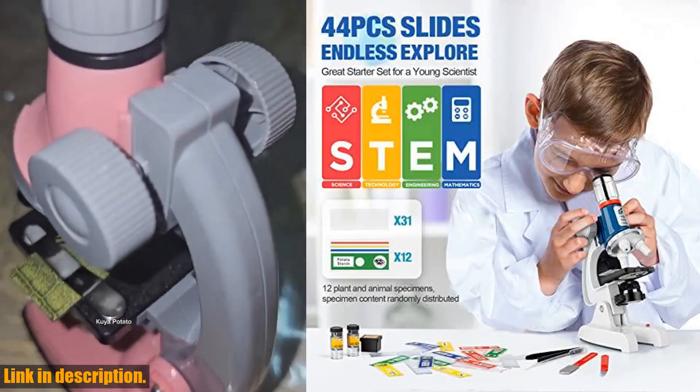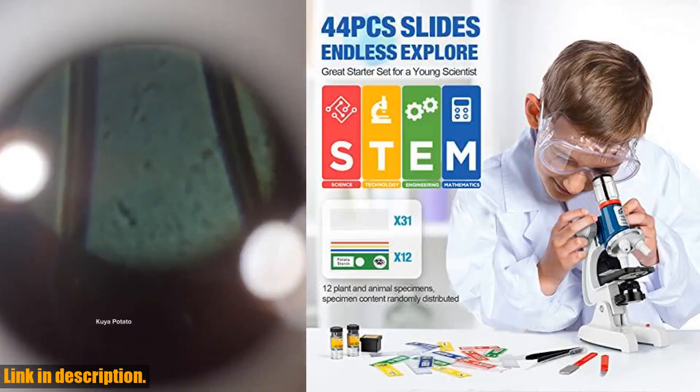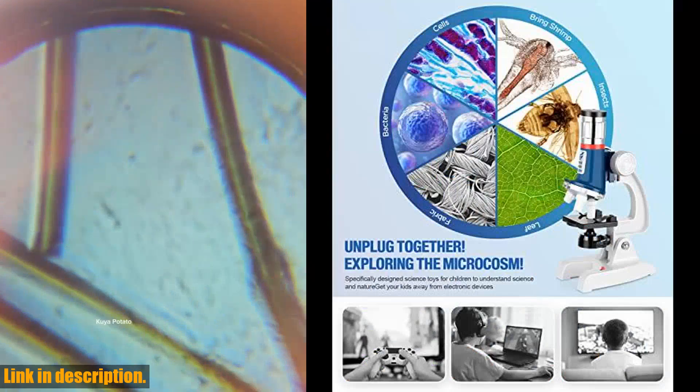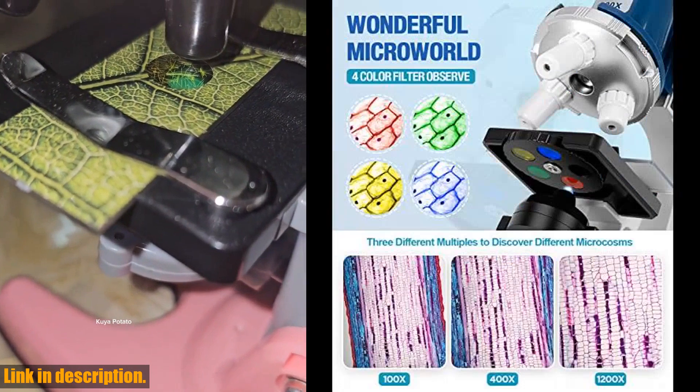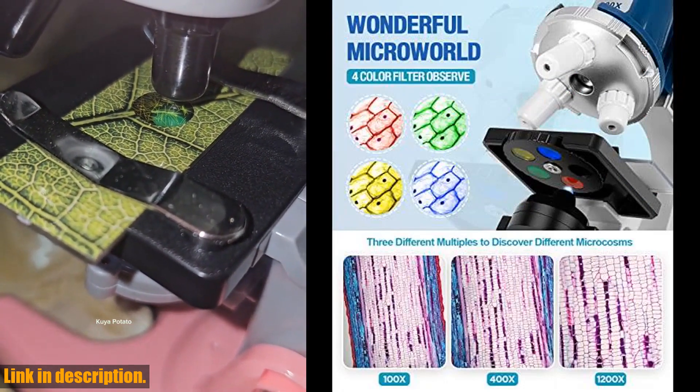It's an excellent educational STEM toy, perfect for homeschooling or as a gift for special occasions. The Metal Body Microscope Kit comes in a portable ABS carry box, making it perfect for on-the-go exploration or use in the classroom.